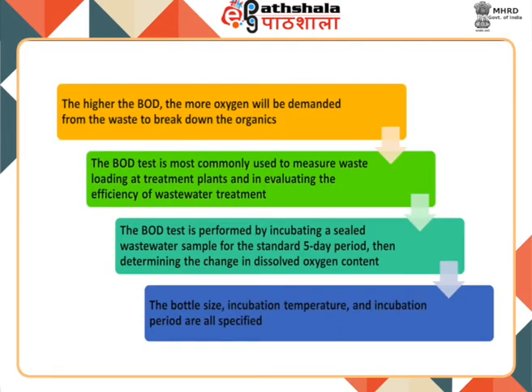The higher the BOD, the more oxygen will be demanded from the waste to break down the organics. The BOD test is most commonly used to measure waste loading at treatment plants and in evaluating the efficiency of wastewater treatment. The BOD test is performed by incubating a sealed wastewater sample for the standard 5-day period, then determining the change in dissolved oxygen content. The bottle size, incubation temperature and incubation period are all specified.